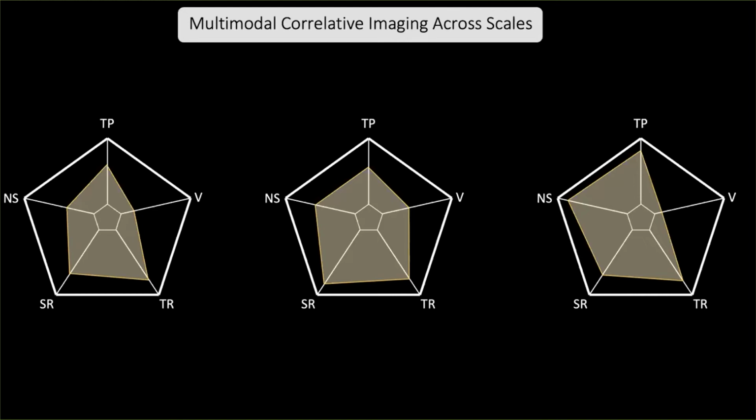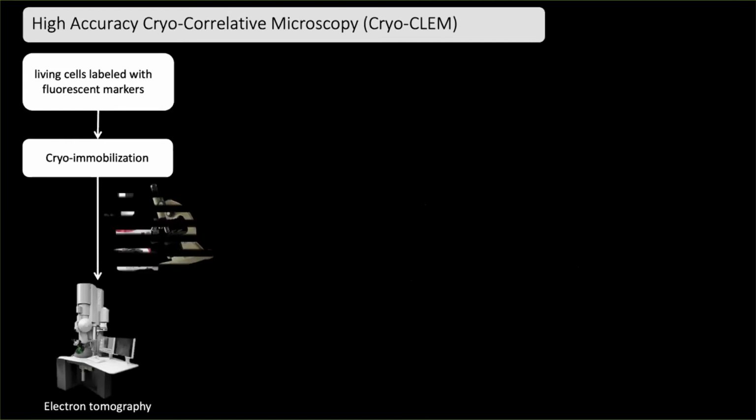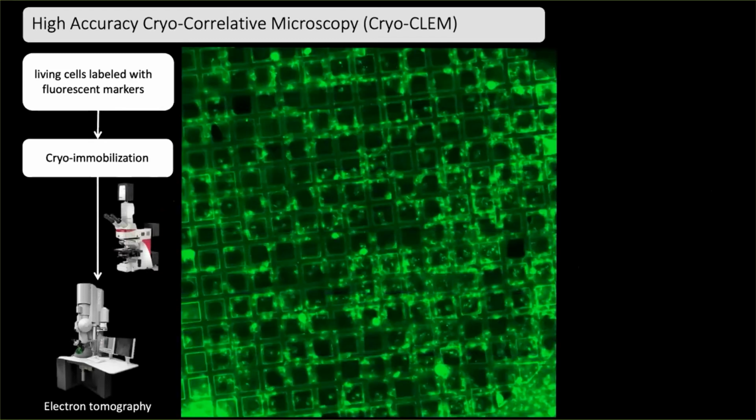Yeah, sure. Let's say I just wanted to use the opportunity to point out that in terms of a workflow, the workflow I just presented, wherein you immobilize your sample, you then, using freeze substitution, embed it in resin, adds a lot to your throughput because the sample becomes mechanically stable. You can section through it relatively easily. You can work on it on different days, it's less sensitive to environmental perturbations.